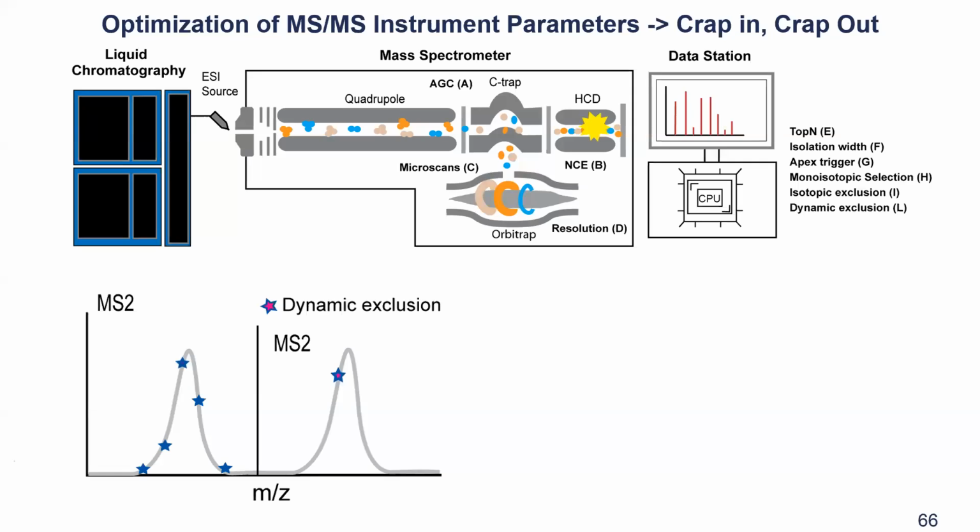All right, and then perhaps the most important one. I was mentioning it already a couple of times at the beginning, but please use dynamic exclusion. I think pretty much every mass spec platform has these settings in some form, and you want to exclude the ions for at least a couple of seconds after you have fragmented them. Otherwise you get these lines of fragmenting and measuring over and over, looking at this heat map, it's LC-MS maps.